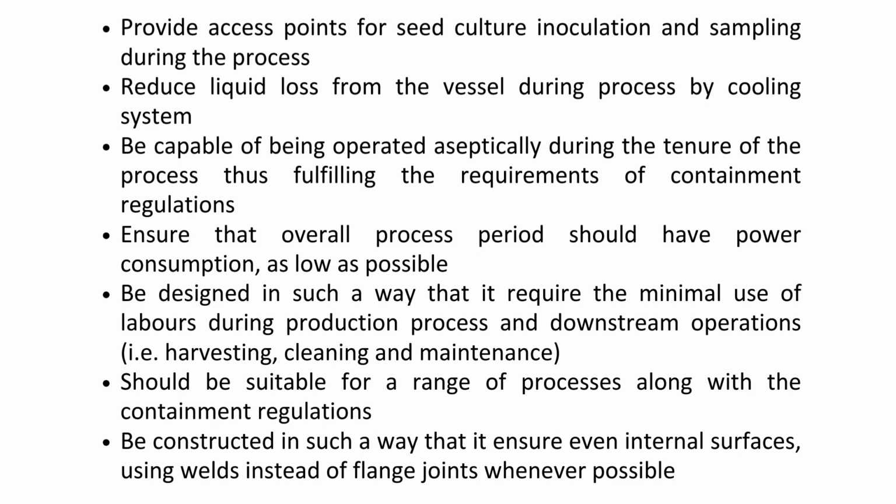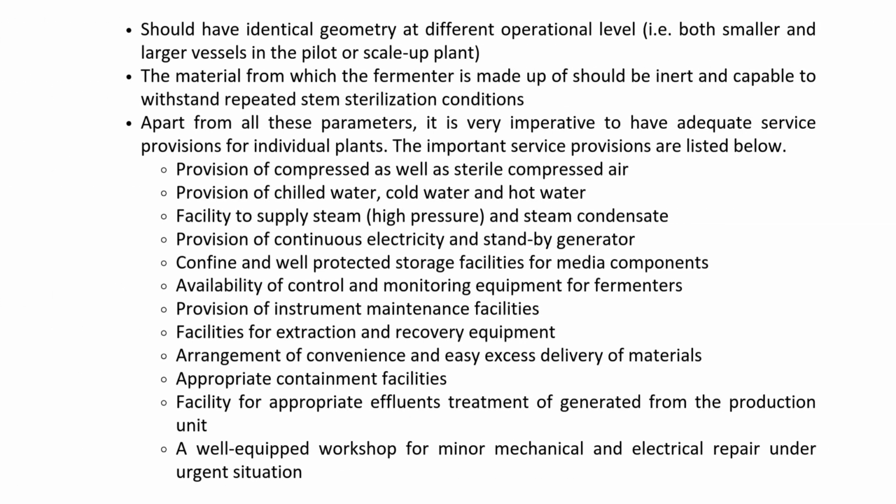It should reduce liquid loss through its cooling system and be capable of operating aseptically to meet containment regulations. The overall process should have low power consumption. The design should minimize labor during production and downstream operations like harvesting and cleaning. It should be suitable for a range of processes and have even internal surfaces, using welds instead of flange joints whenever possible. The fermenter should have identical geometry at different operational levels, meaning both smaller and larger vessels in a pilot plant should be similar.